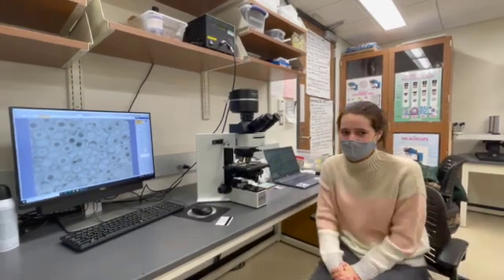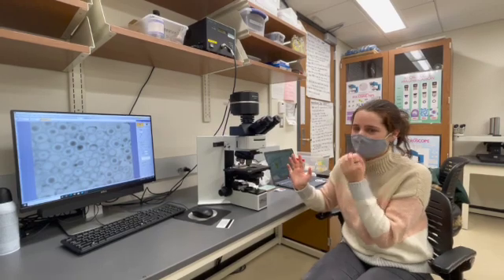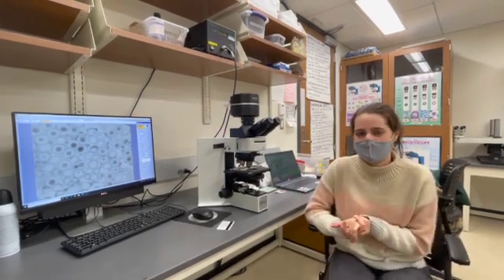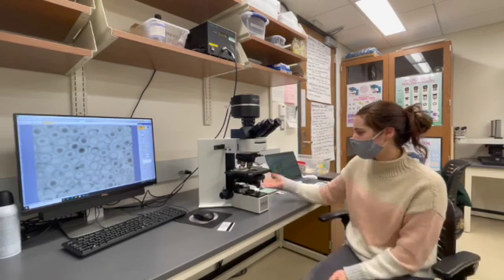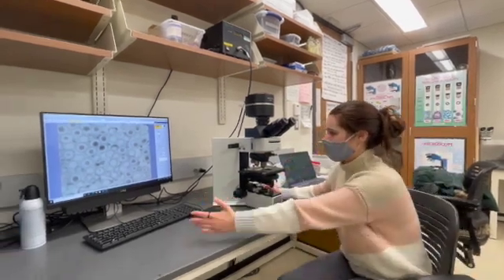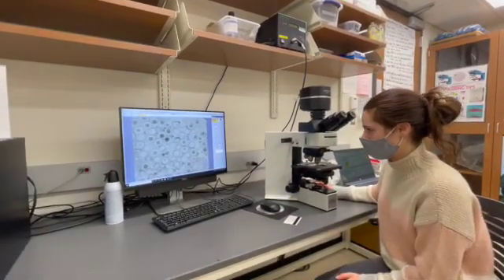Hey guys, so we're looking at the same slide again, this time on the Olympus microscope. Before we look at it in phase, we want to get a good photo of the image in bright field. So we turned on our microscope, turned up the brightness, and right now we're going to get our sample in focus using the fine focus.